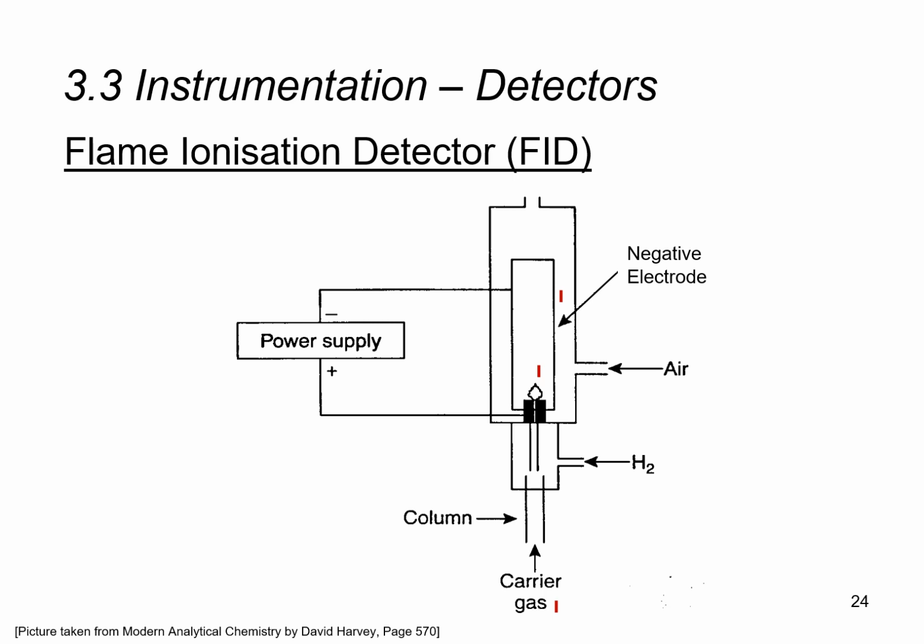So as more and more ions are generated and collide with the negatively charged electrode, that will indicate that there are quite a lot of that chemical component present, and if only a few ions are generated that collide with the negative electrode, that will indicate that only a small amount of these gaseous components are present.